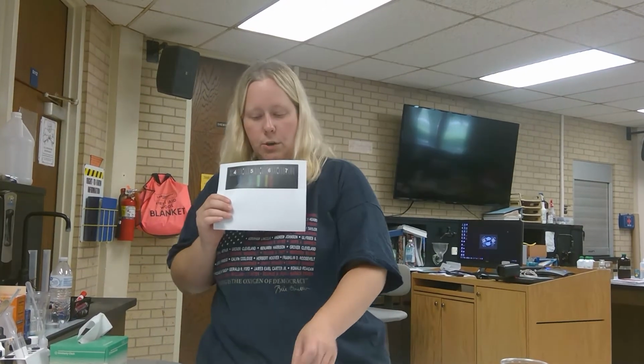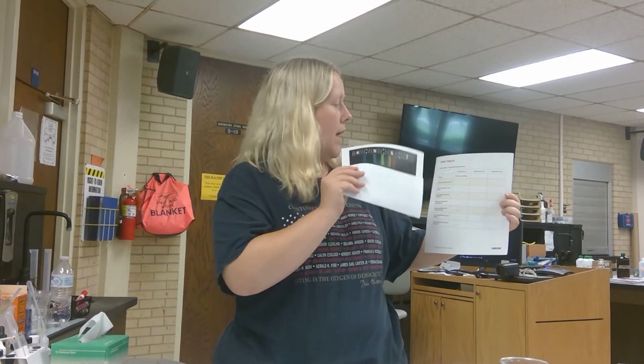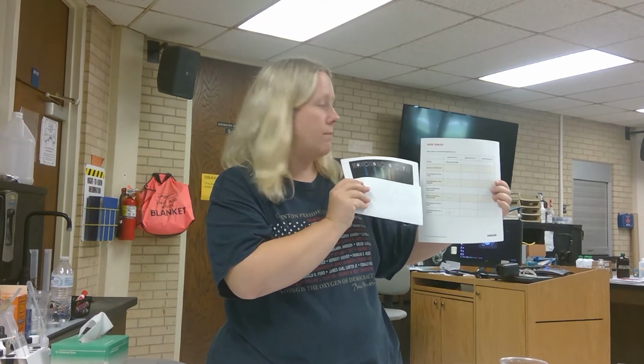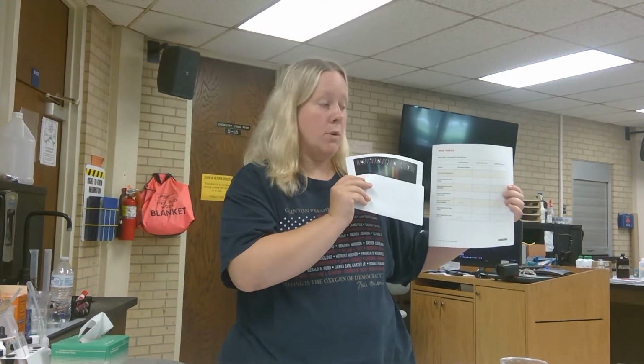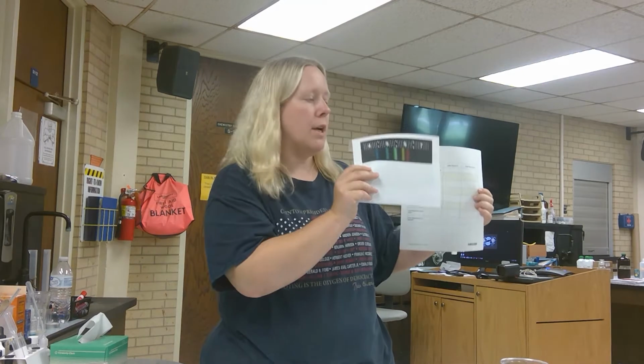What you need to do is take your data table 1. They only ask for 3 colors. So they ask, is it a line spectrum or is it a continuous spectrum? I'm going to let you decide that.